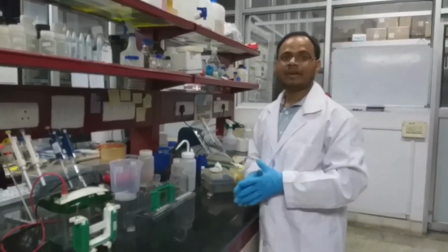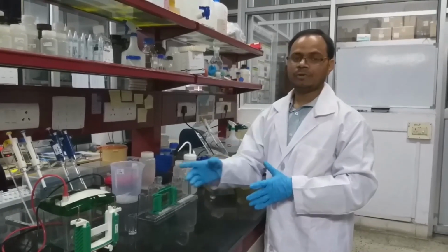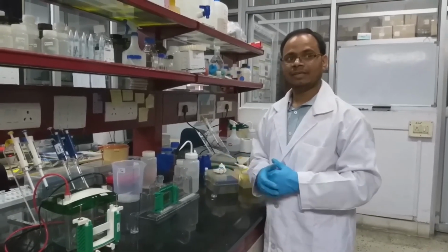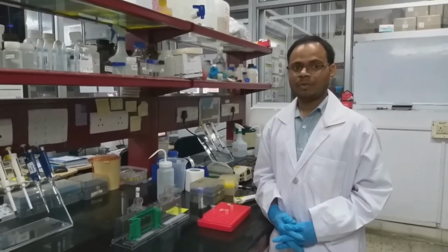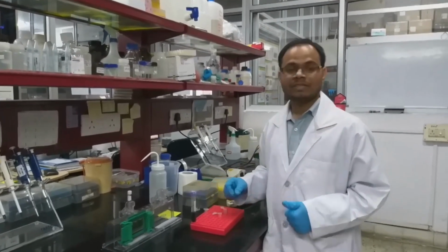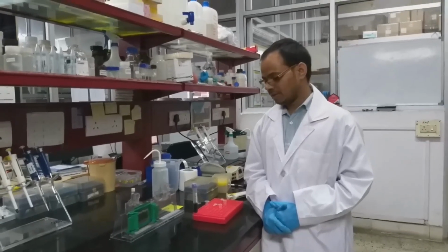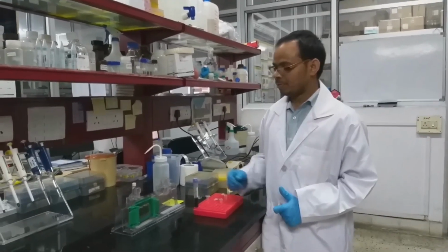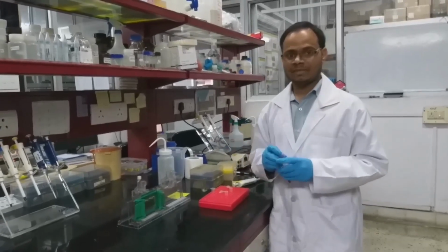Now we will wait until the gel is solidified, then we will shift to the buffer tank and run the gel. While the stacking gel is solidifying, we have to prepare the sample for loading in the SDS-PAGE gel. So for that we have to prepare loading dye, 10x or 6x loading dye.